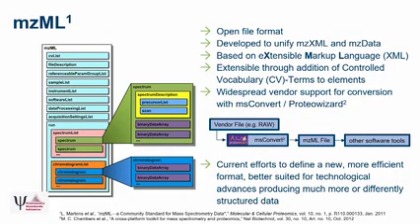I would guess that most of you have probably come across mzML before. This is quite an old format nowadays. It was published in 2011 and is very well supported, also from the vendor side. So the mass spec vendors also support MSConvert, which can then use native vendor libraries to create the mzML files containing a lot of the metadata we need from the raw machines, basically. And this is also closely tied to the controlled vocabulary of the PSI-MS.